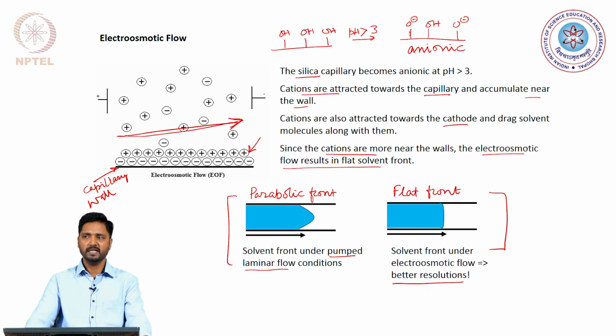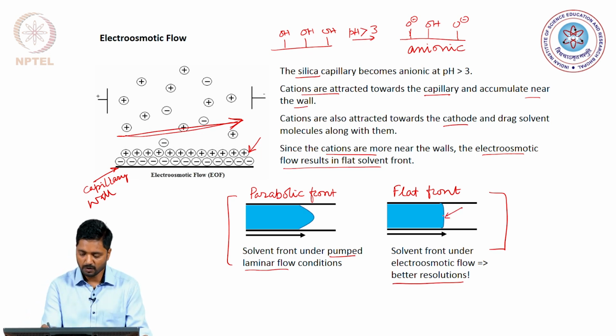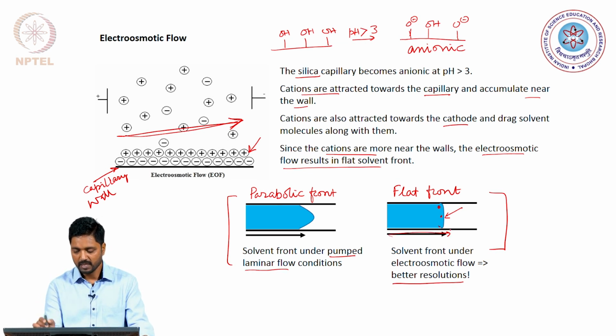So, let me explain this concept a little further. Since we are having a very flat front, it does not matter whether our particle is here or here or here. In all the three cases, the particle is at a very similar position within the capillary at a particular instant of time.